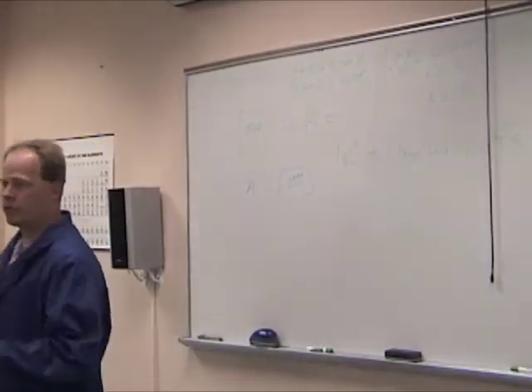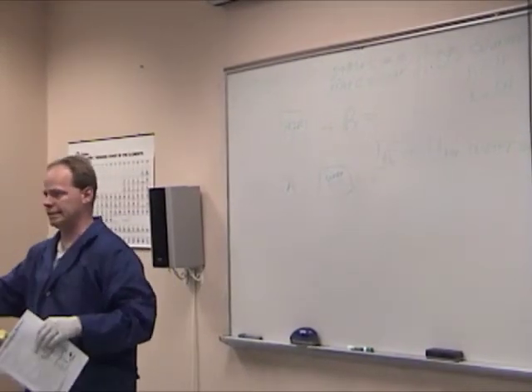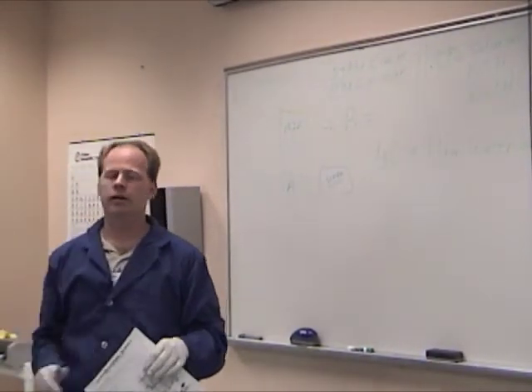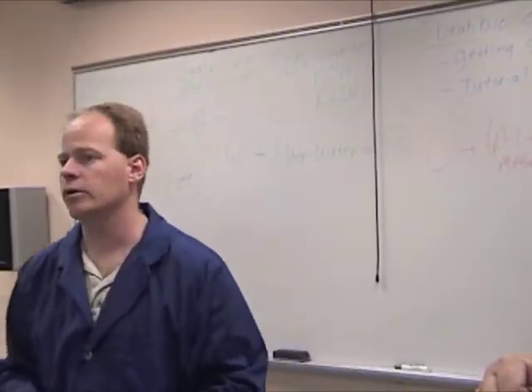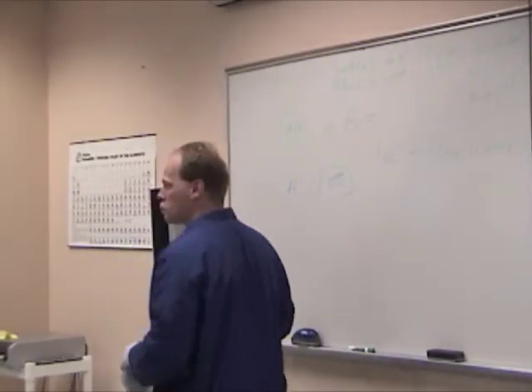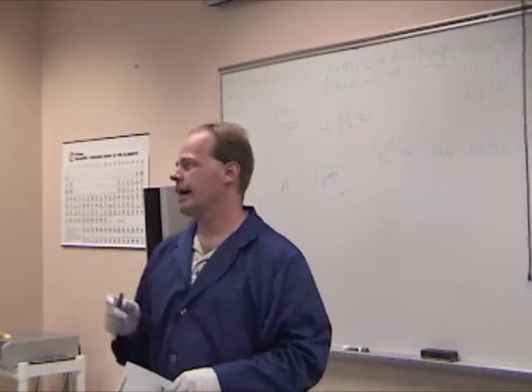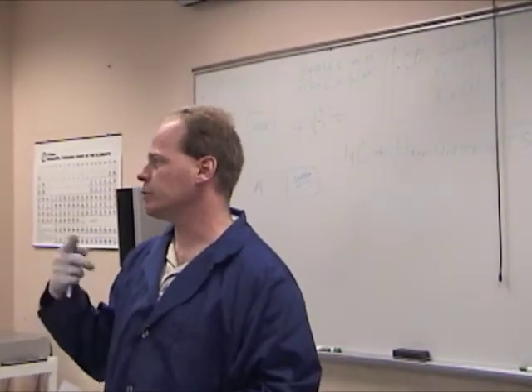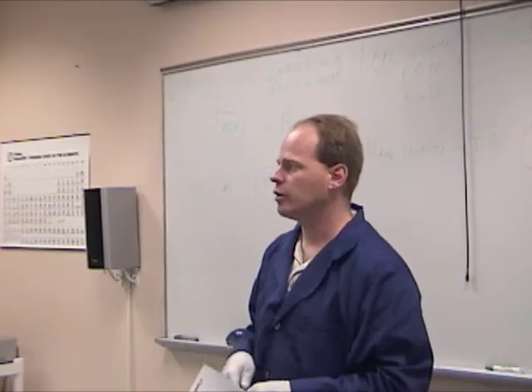So anytime I produce my titration solution, I get a black magic marker out and write poisonous on it, and I store it somewhere where it's not going to be touched by anyone. If you get ours, it's got a highly corrosive sticker on it, but it's important that you mark that. Does it make a difference if it's in the refrigerator? Doesn't really make a difference. I will tell you that after about 90 days, refresh it, because even moisture in the air will make it go bad.